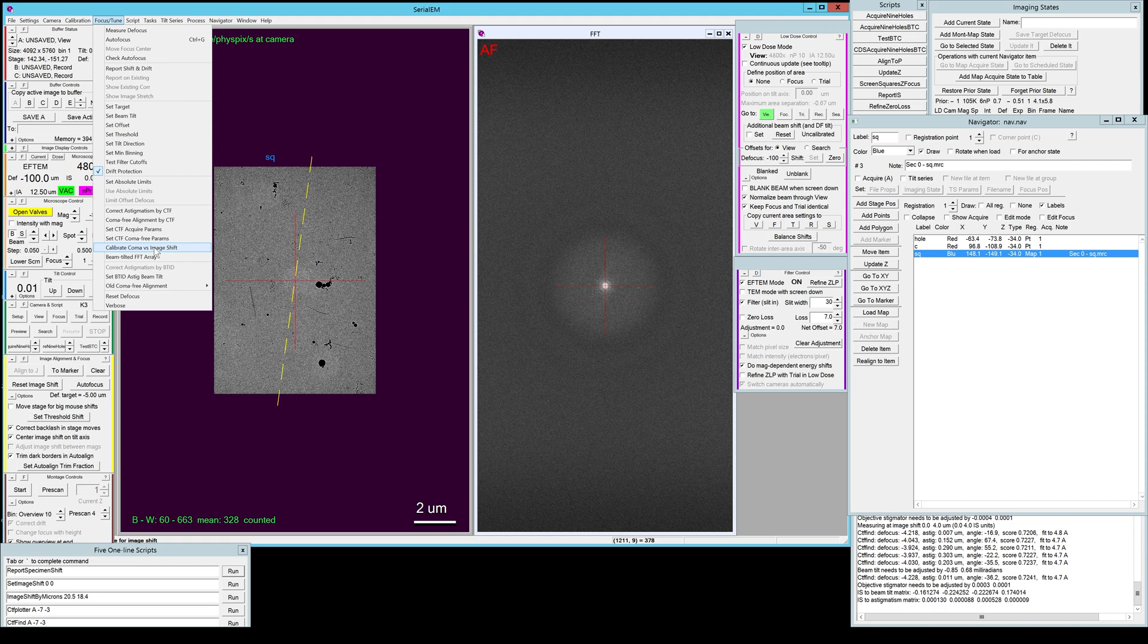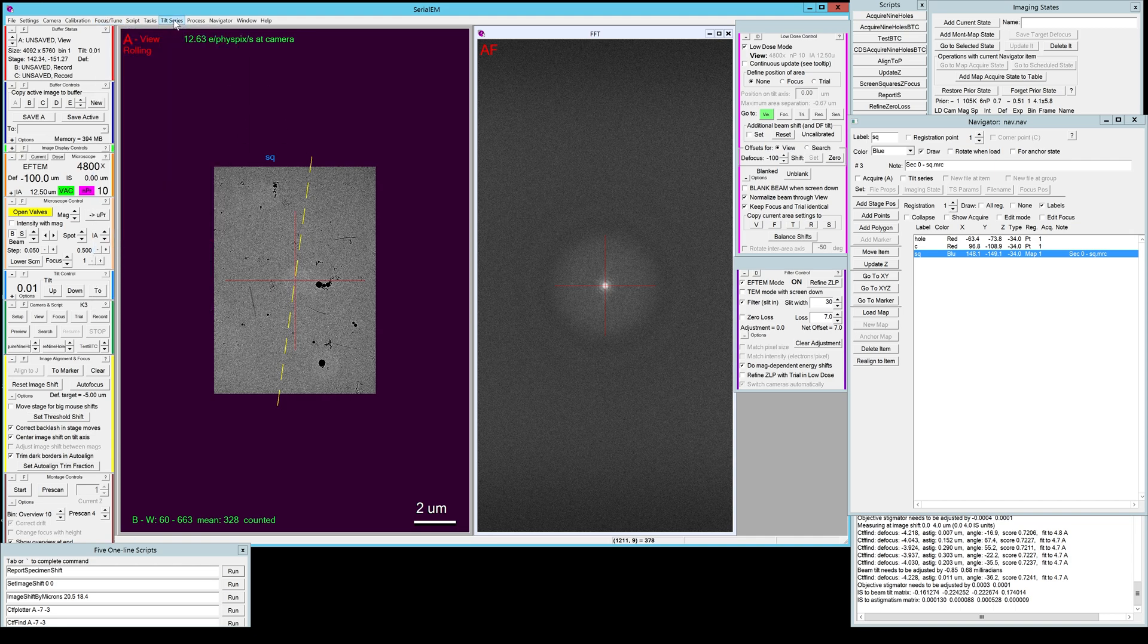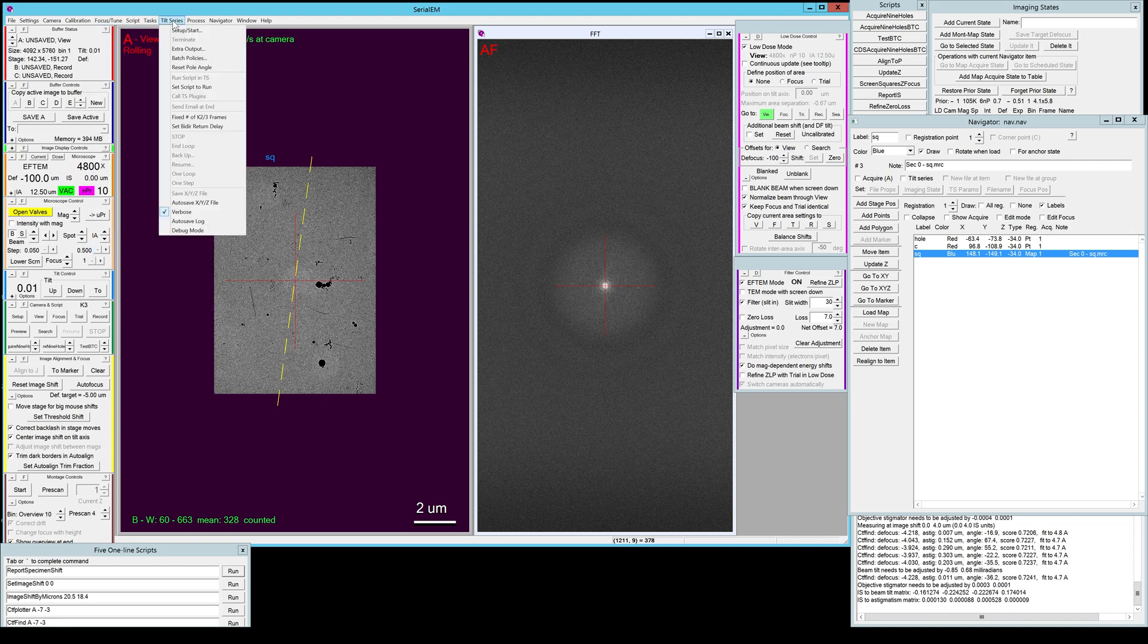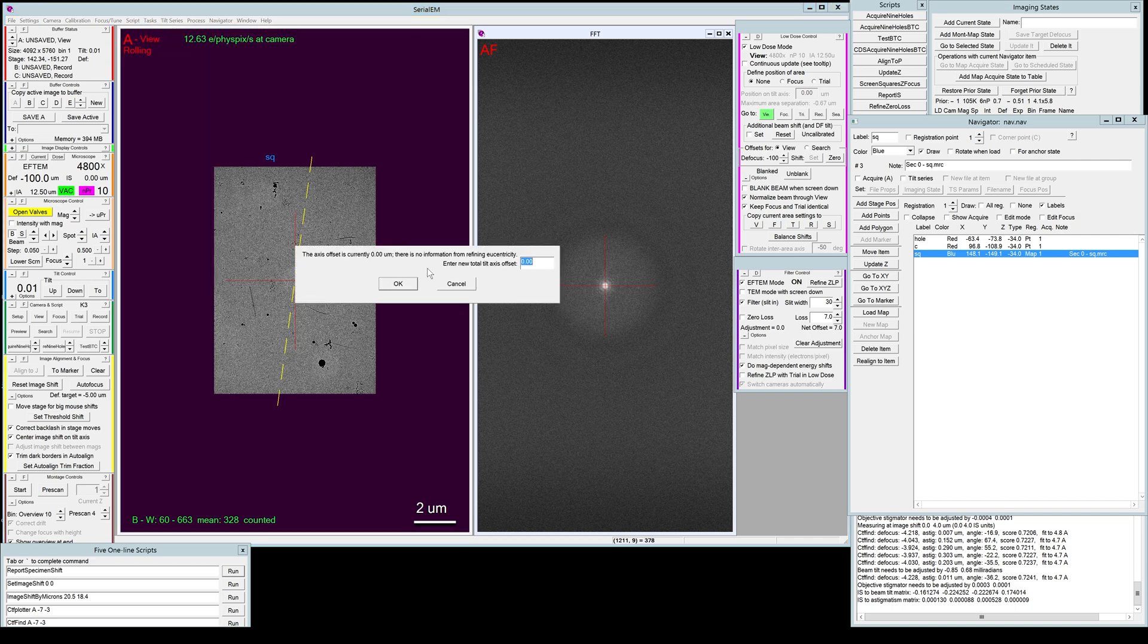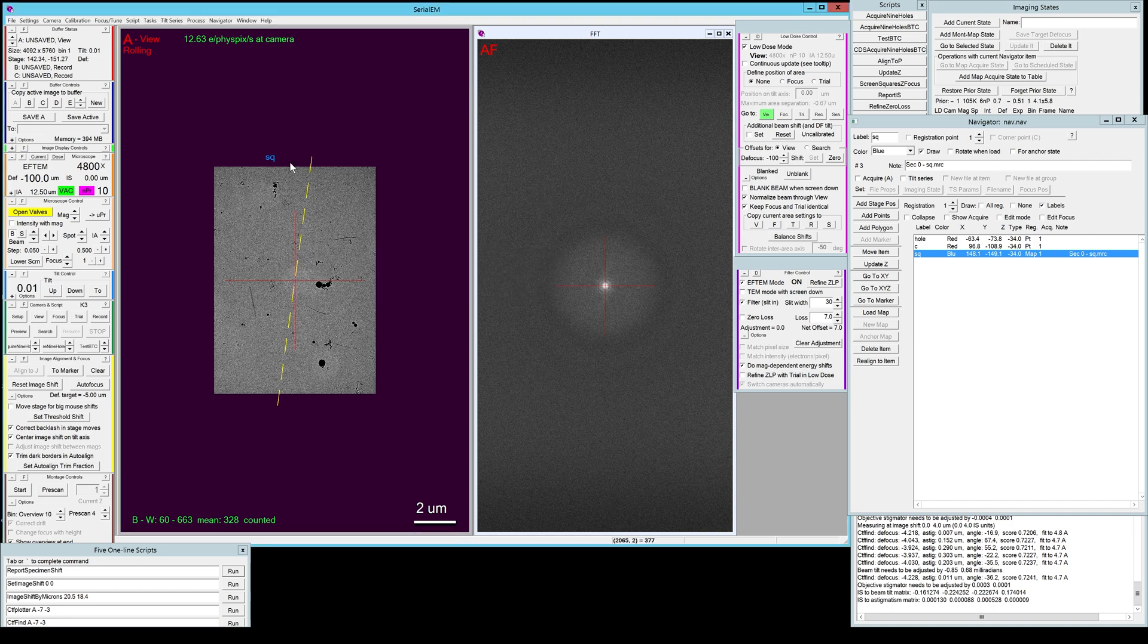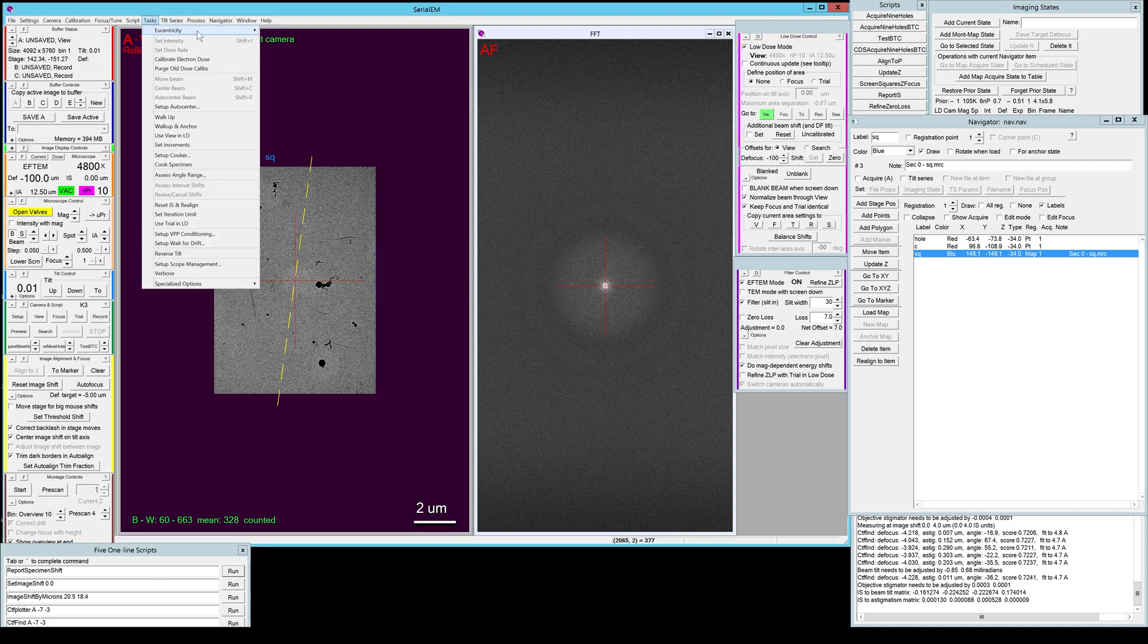Another setting that is important to make sure that you don't have a strong defocus gradient throughout the tilt series is the tilt axis offset, and that can be set in Tasks, Eucentricity, Set Tilt Axis Offset. So right now it's set to zero.